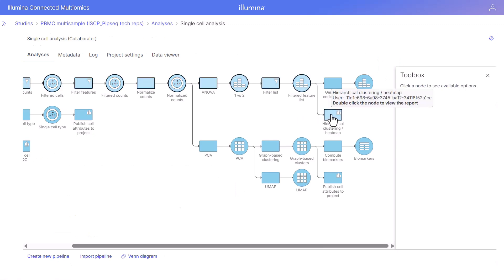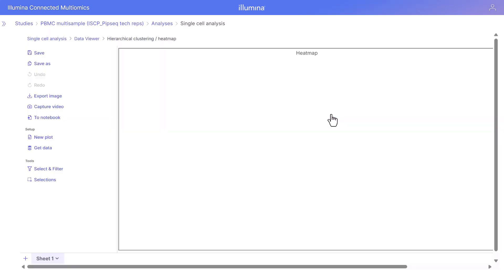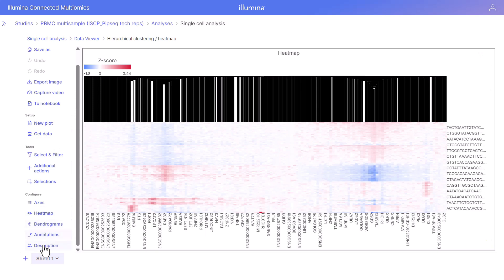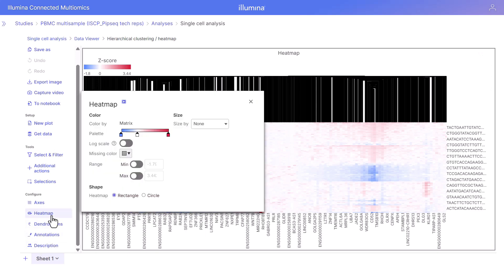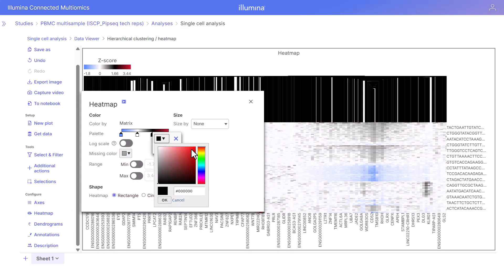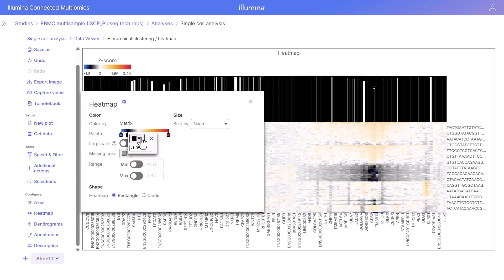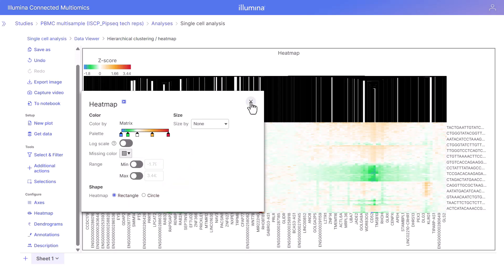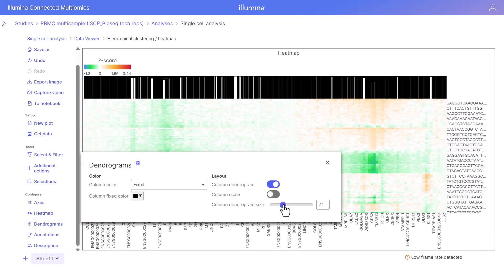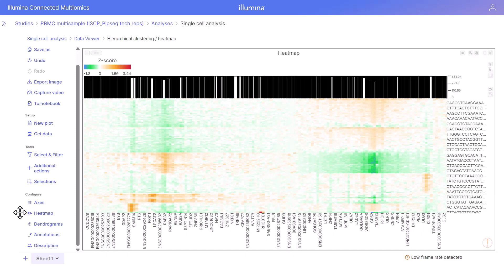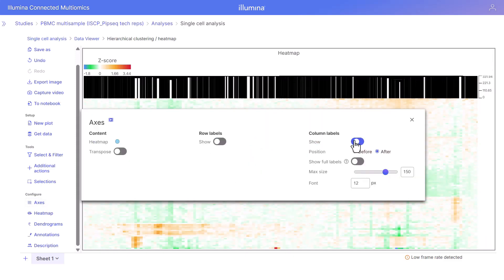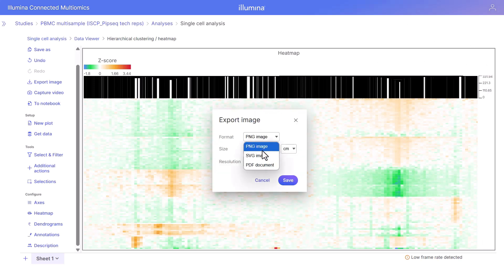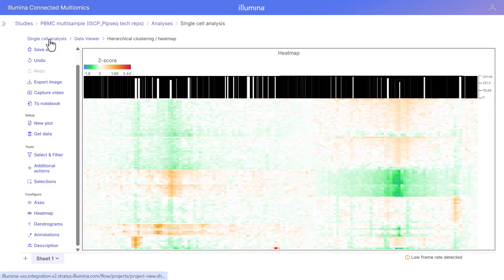Let's open the output from the hierarchical clustering heat map task. This opens the visualization in the data viewer where we can use configuration settings to modify the visualization — changing the color, adjusting the dendrogram columns, adding scale, and turning off row and column labels. In this way you can make these visualizations and export them to your machine in a variety of different formats.